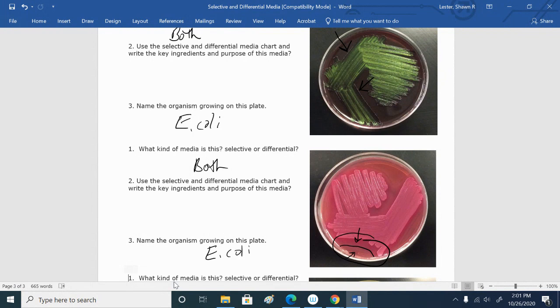Now, you heard in the video, she mentioned this word, coliform. Of course, the name coli tells you one of the main organisms, which is E. coli. But I like to think of coliforms as E. coli and its friends. So these are gram-negative rods that live in the intestines of most mammals.